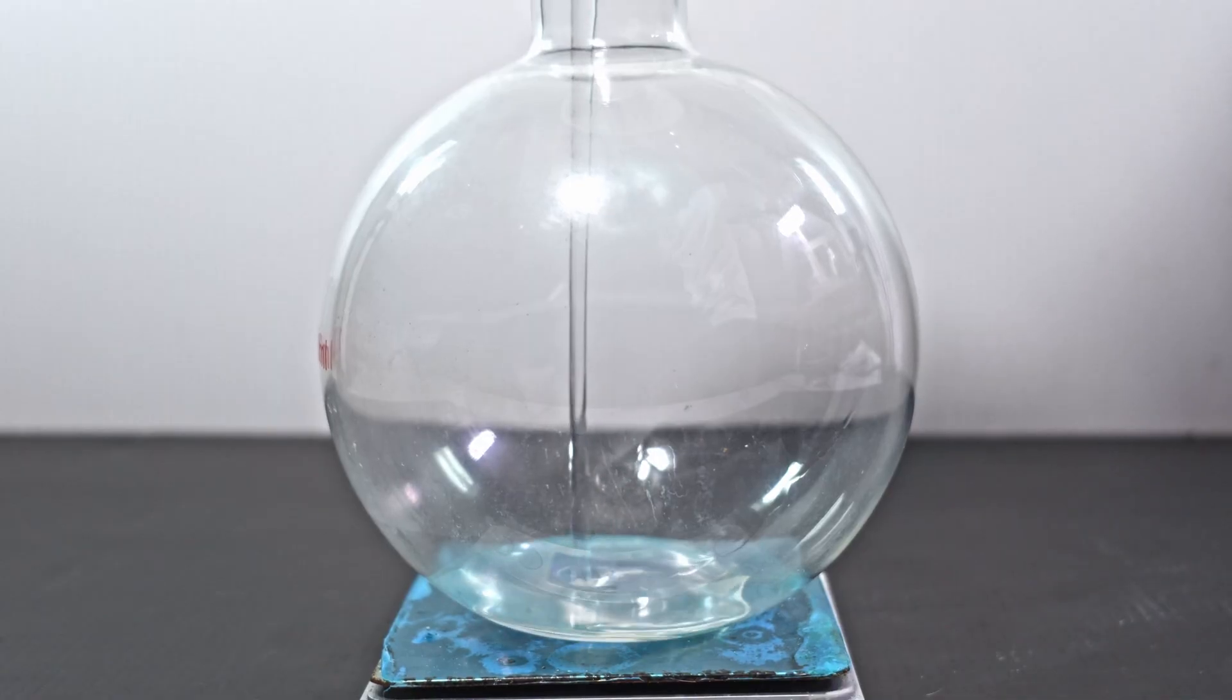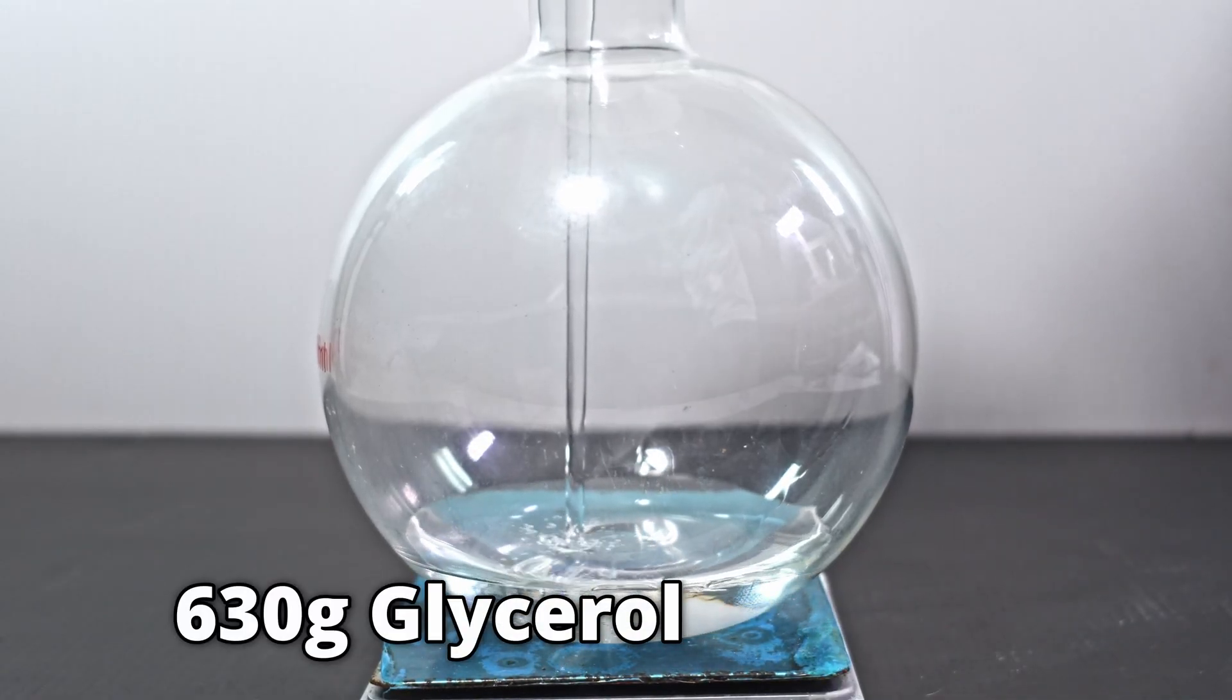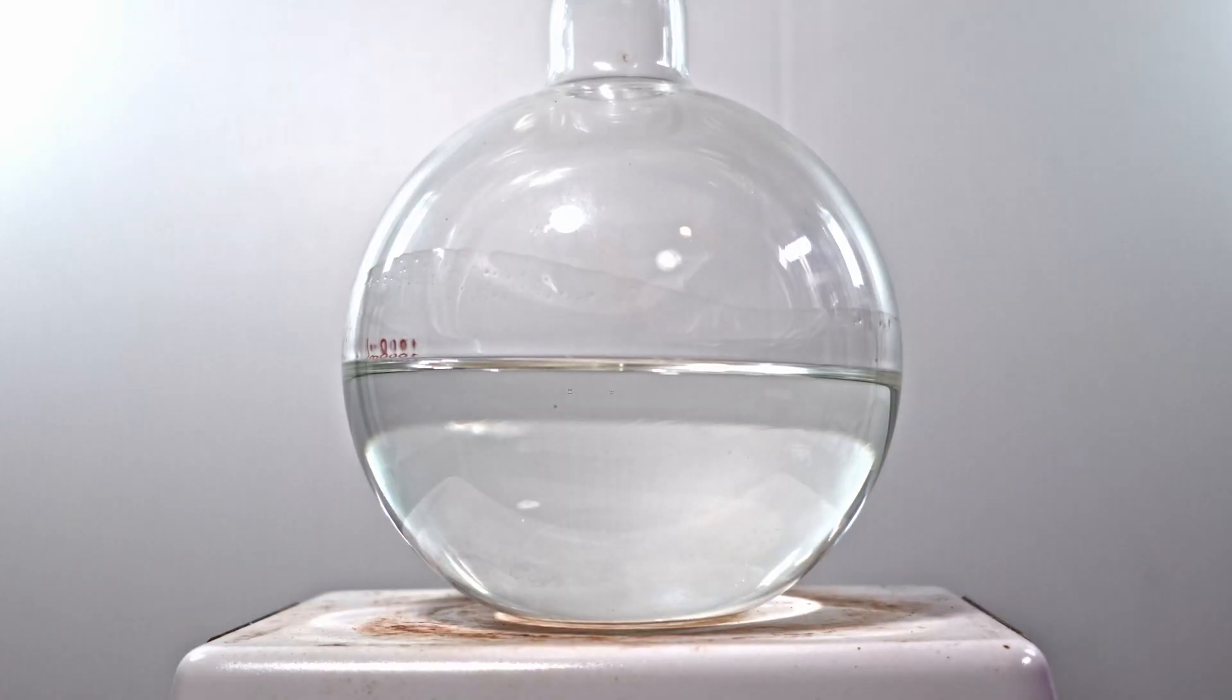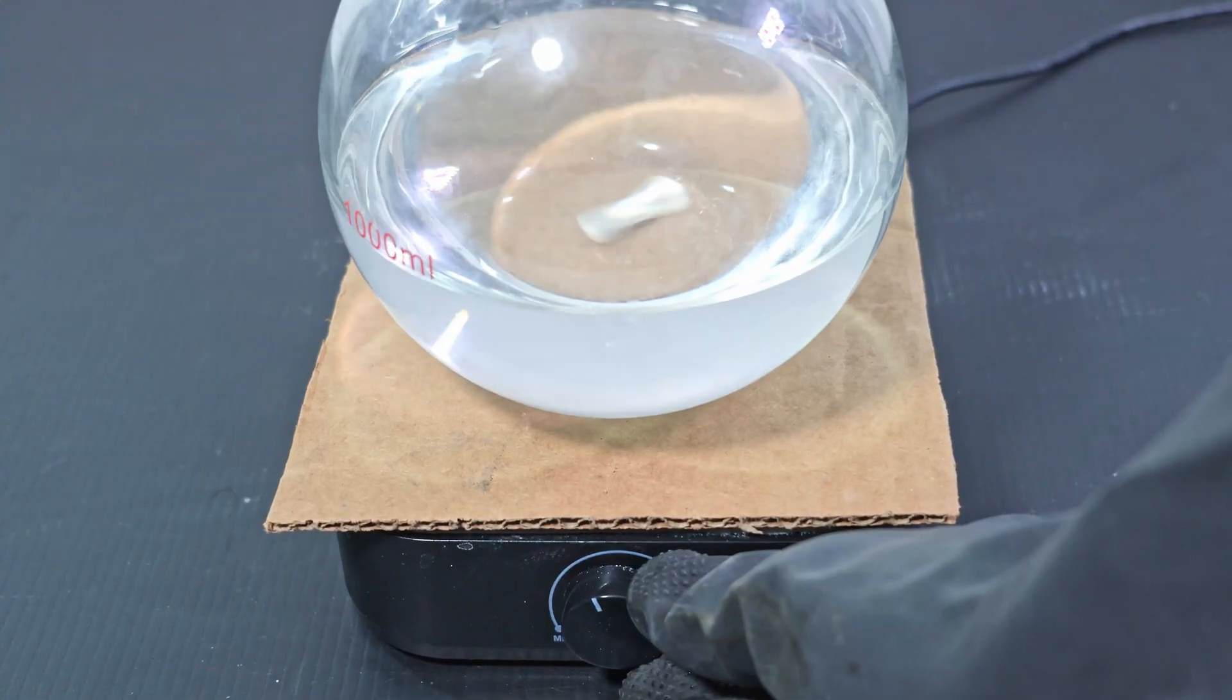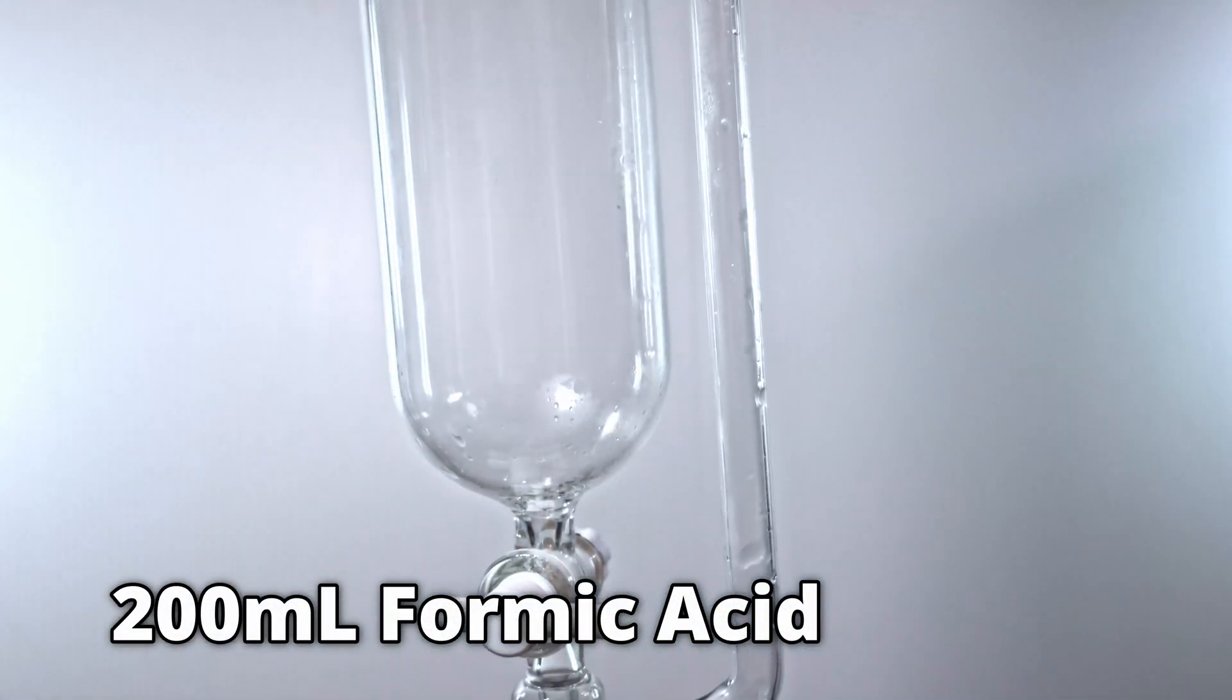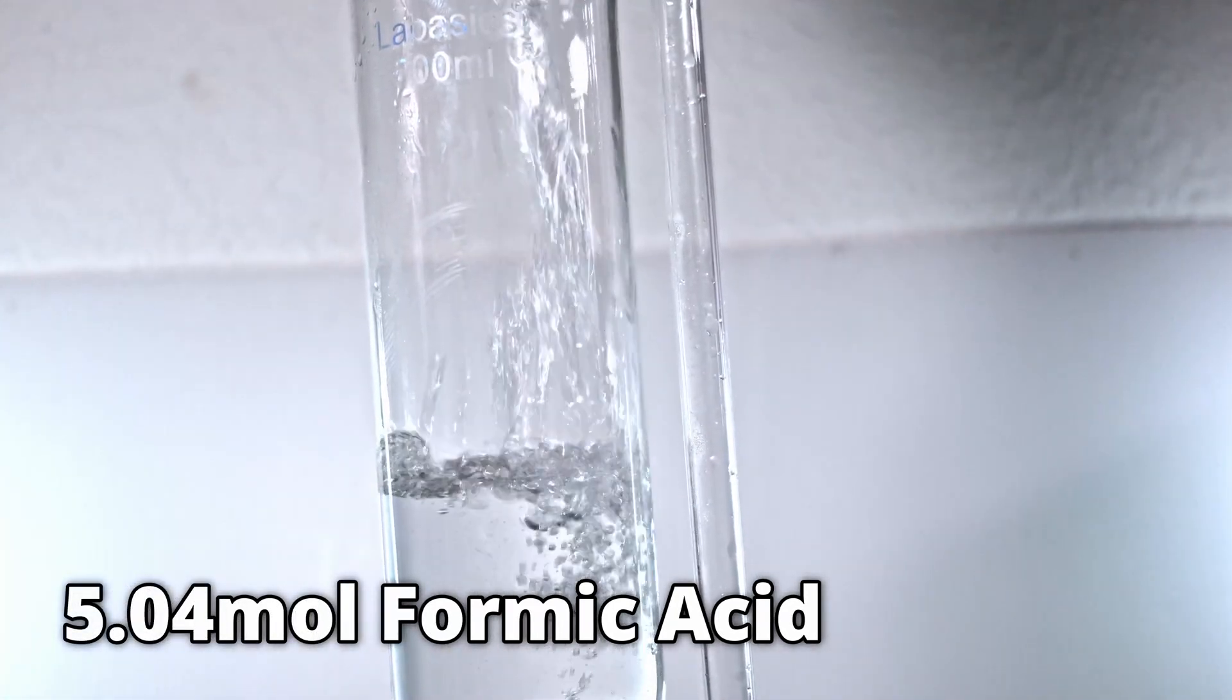I am first going to add 630 grams of glycerol into a 1 liter flat bottom flask. This is roughly 6.85 moles of glycerol. I am going to warm it a bit to get it nice and running. I put it on a stir plate on medium. I attach my addition funnel with 200 milliliters of pre-warmed formic acid. This is approximately 5.04 moles of formic acid.